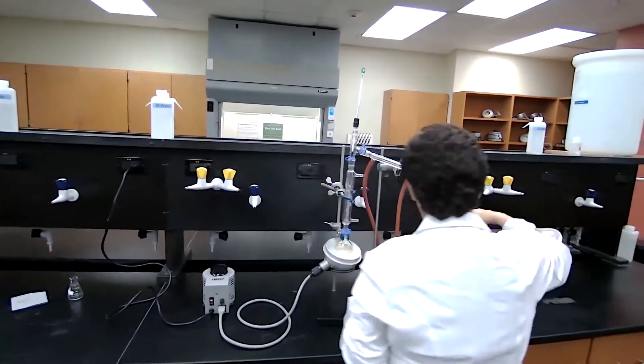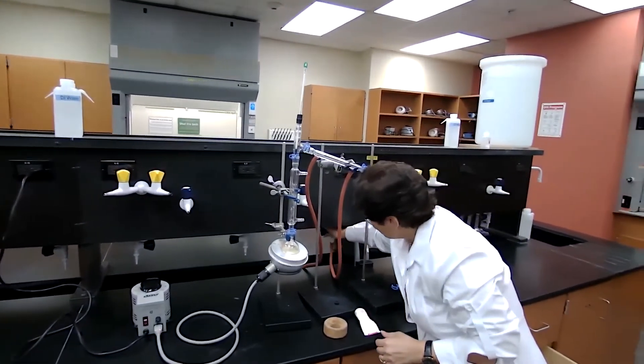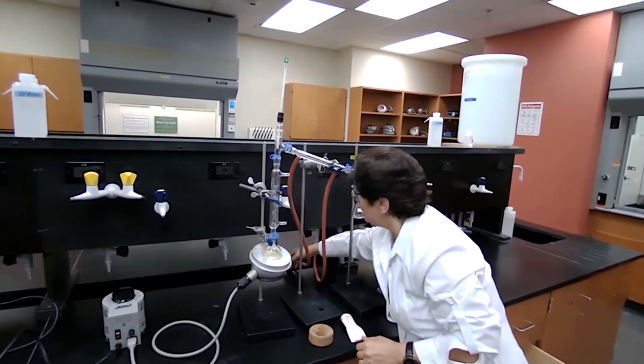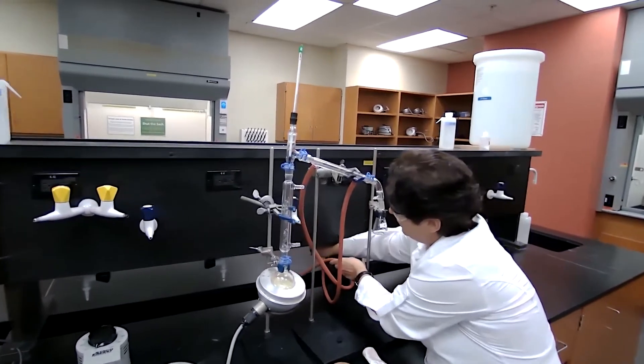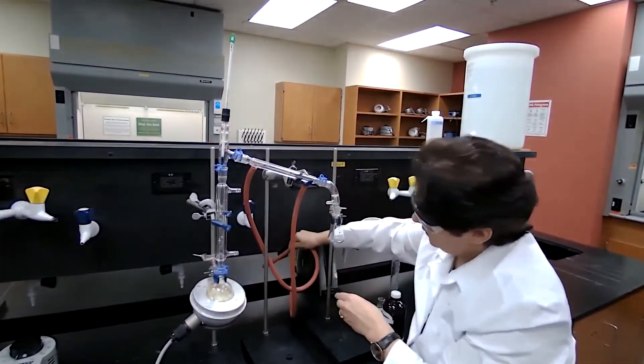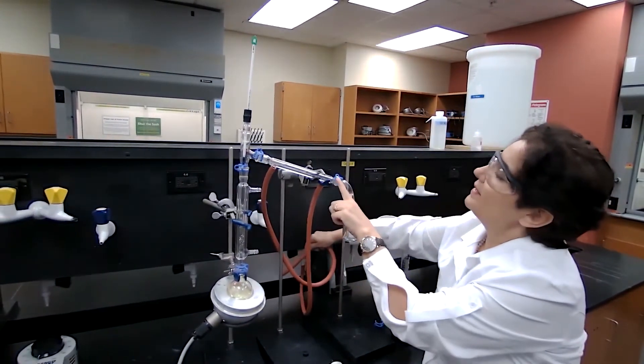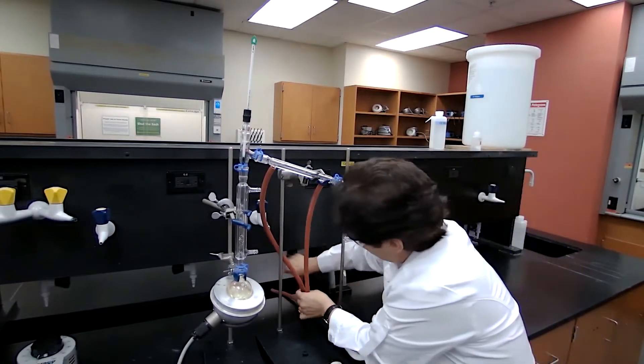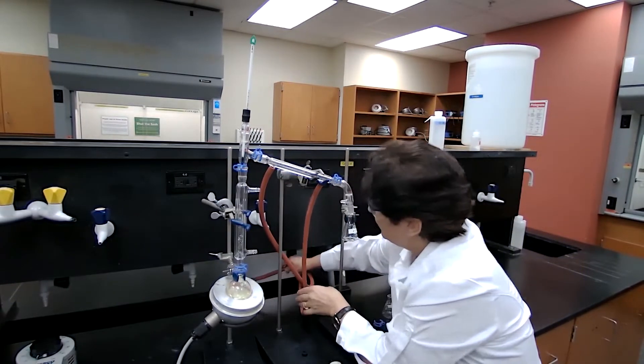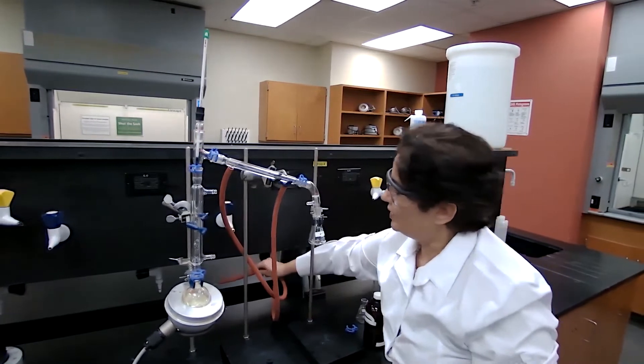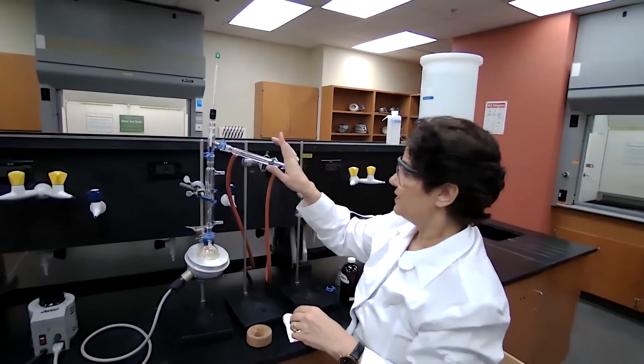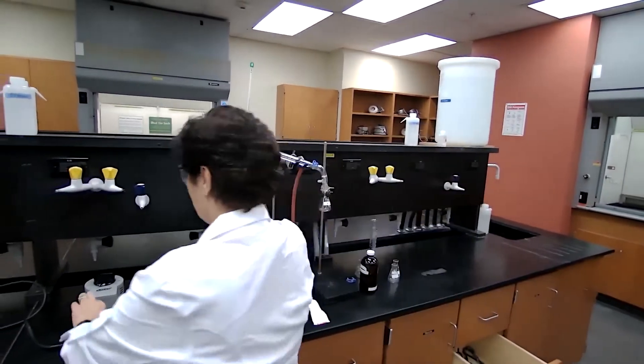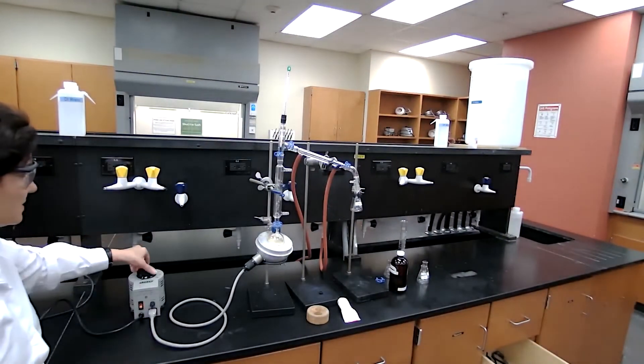We always turn on the water. Turn on the water gently. You want to see the water flow. Condenser is filled up with water and there is a low flow of water. Turn on the water first. Turn on the heat second. Turn on the heat.